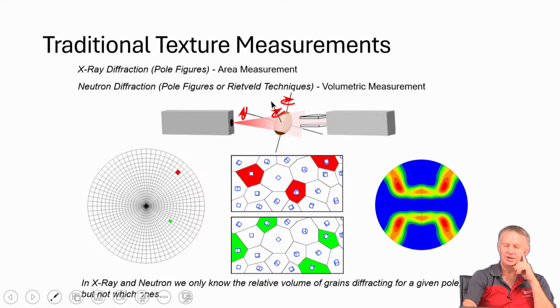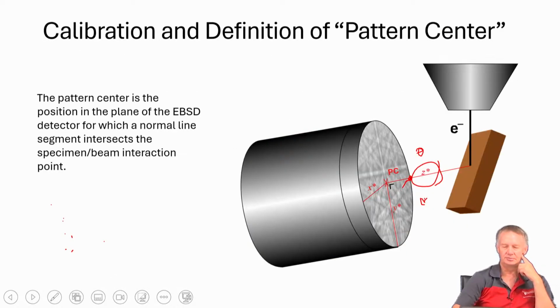And then over here at the detector, you're getting what is seen at that specific angle. And then you go around and you check what the diffraction is at all the different angles, right? So you start in the center and then you step around every 5 degrees as you're going out, and you just collect individual intensities at each one of these pixels in the little boxes shown on the plot here.